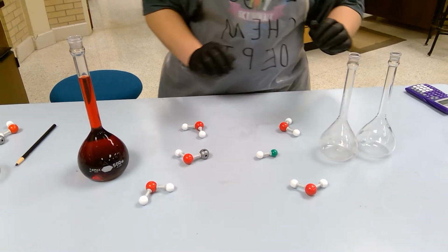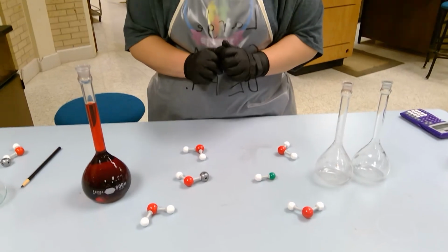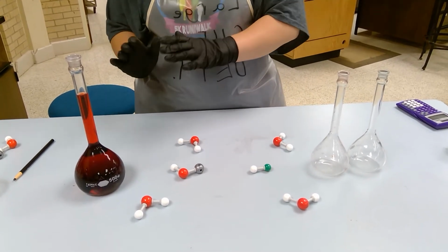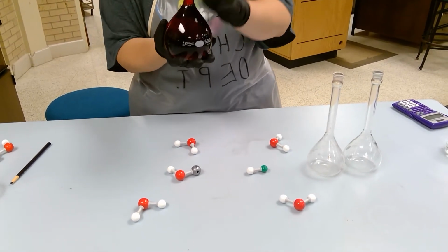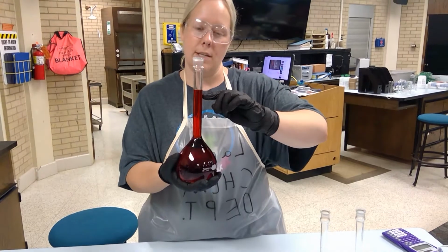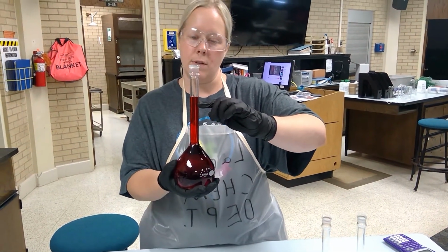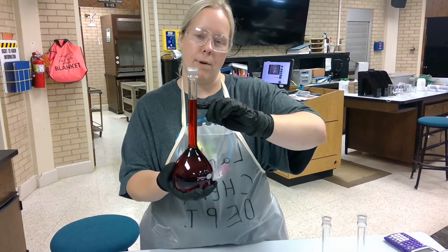And welcome back, and I am here with the answer to my part of the discrepant event. If you recall, when I finished that last question, my volumetric flask had more than 500 milliliters present. So this is where the 500 milliliter line should be, and if you notice, that liquid volume is above where my finger is.